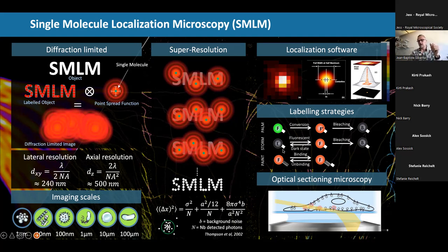or the interesting technique which I will talk about, because it is perfect, at least in our hands, which is the PAINT family, which relies more on the transient labeling of a fluorophore to its target. This is how you go from fluorescent to non-fluorescent states.